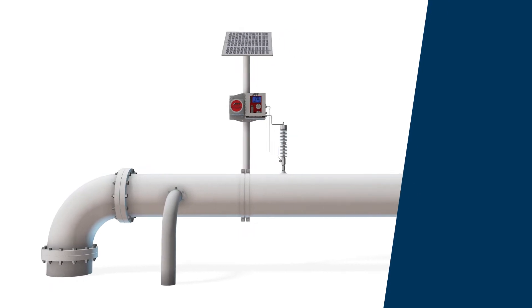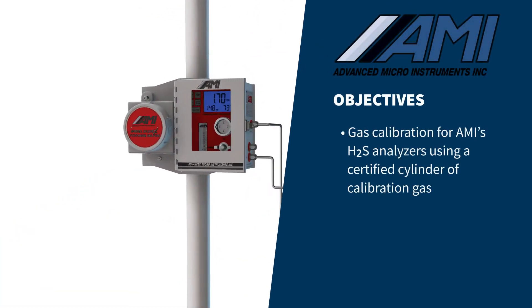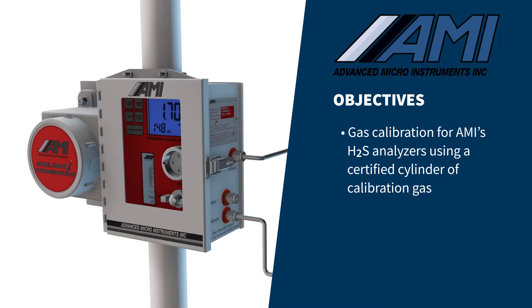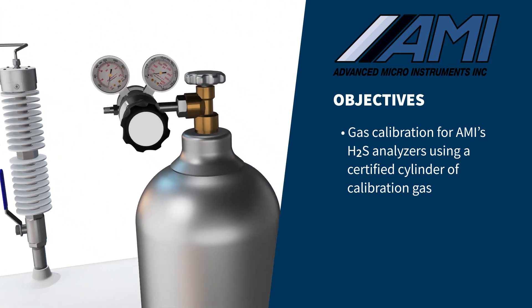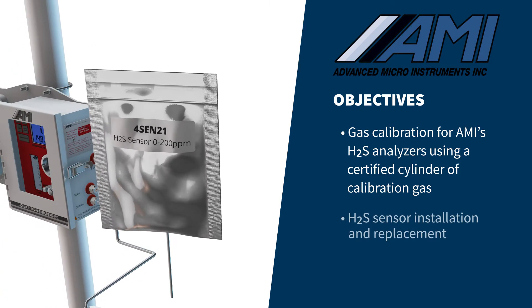In this video, we will instruct you on how to perform a fast, simple, and accurate gas calibration for AMI's hydrogen sulfide analyzers using a certified cylinder of calibration gas. We will also show you how to install a new H2S sensor in the analyzer.